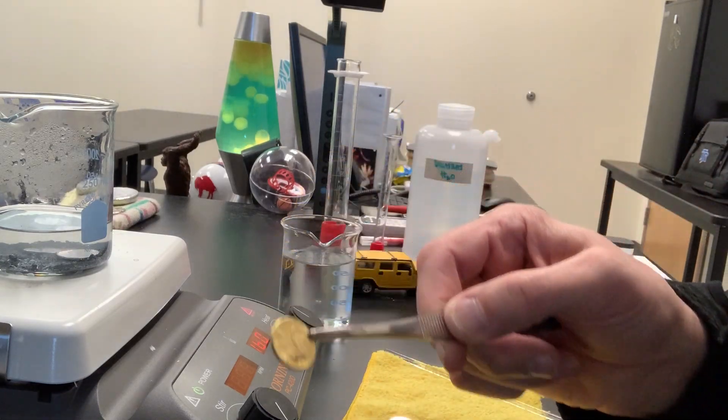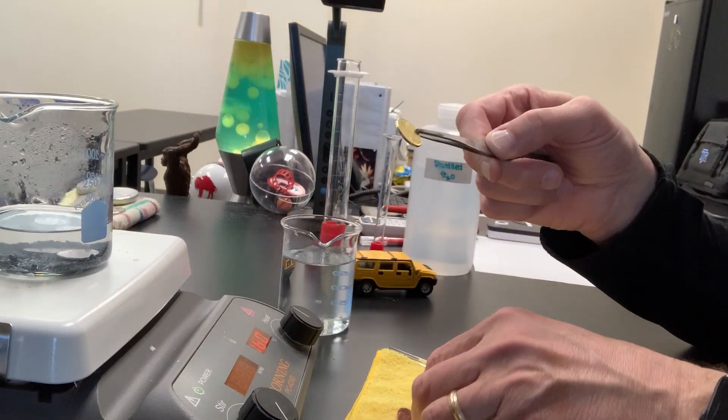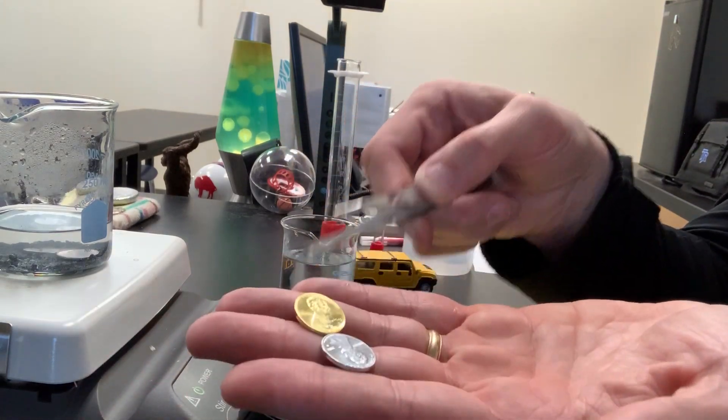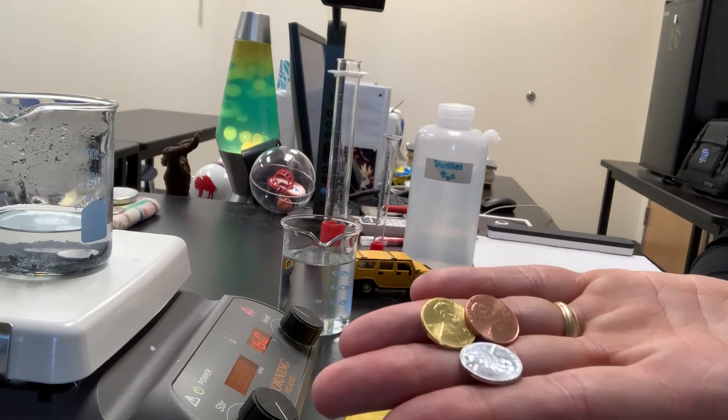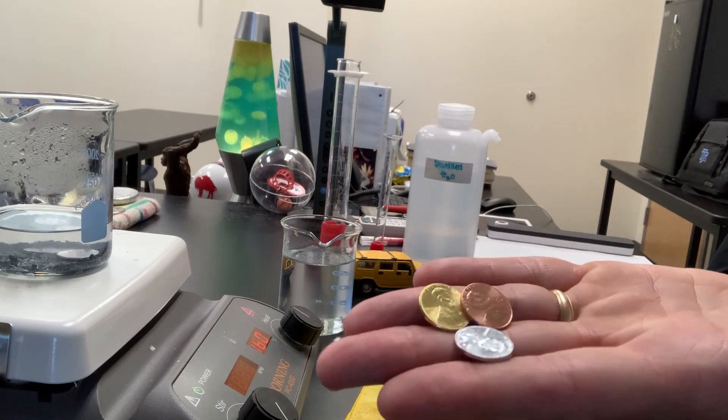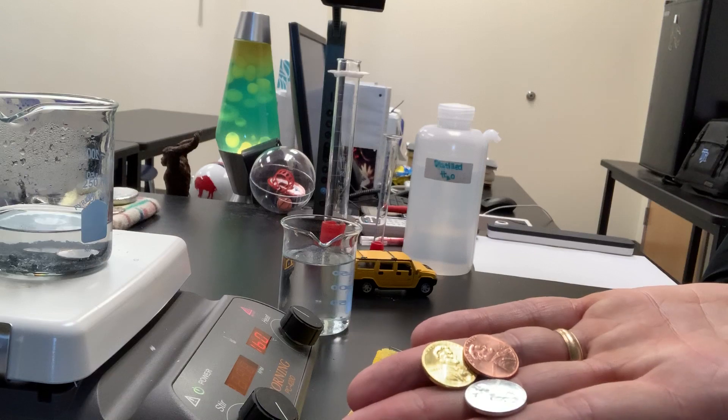When I compare that to the zinc penny from just a moment ago and the copper penny from earlier, we have three pennies: one that's copper on top, one that's brass, and one that has a coating of zinc.